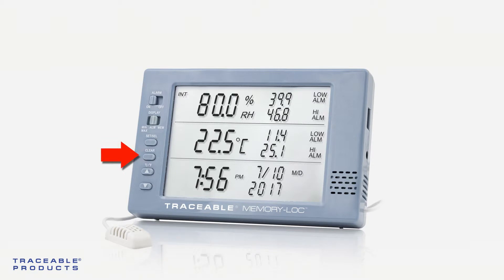Press the clear button on your device to clear the alarm. If both the internal and external probes are alarming, press the clear button to clear the current alarm.